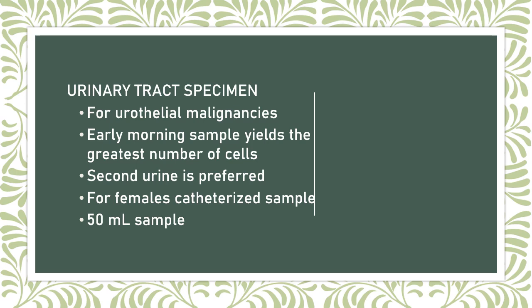So the urine sample preferred in your urinary tract specimen for cytology is your second urine. For females, a catheterized sample is accordingly preferred over clean catch, to avoid contamination with vulvar cells.